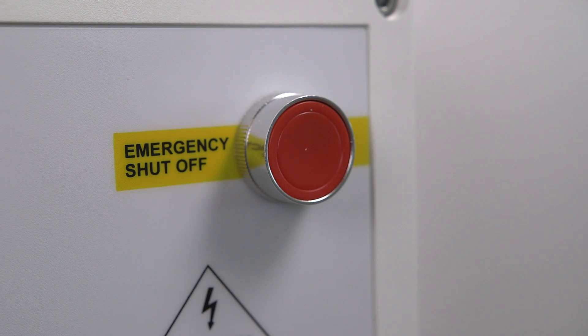Each Merlin panel comes with an emergency push button mounted on the fascia. Once pressed, all utilities will be disabled.